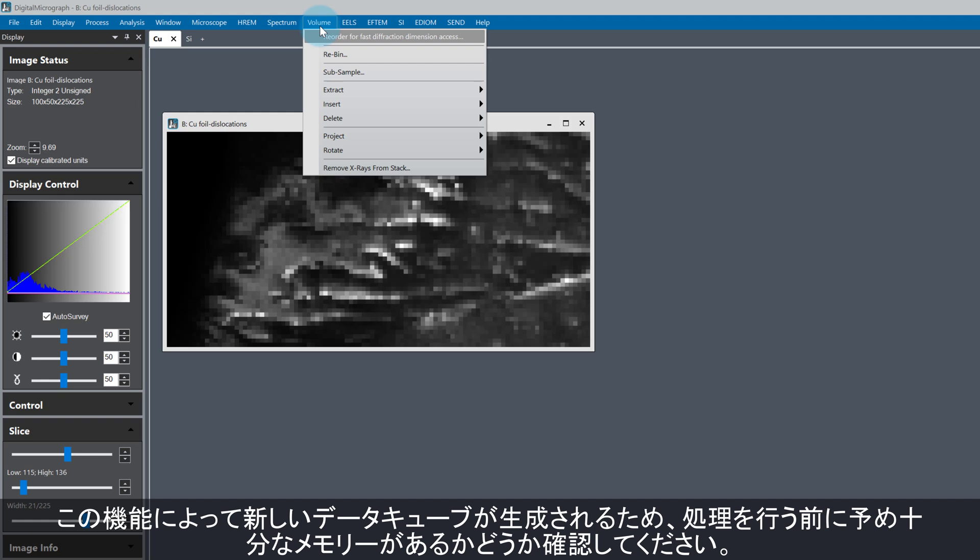A new dataset will be generated if we use this function, so remember to make sure there is enough memory available before doing so.